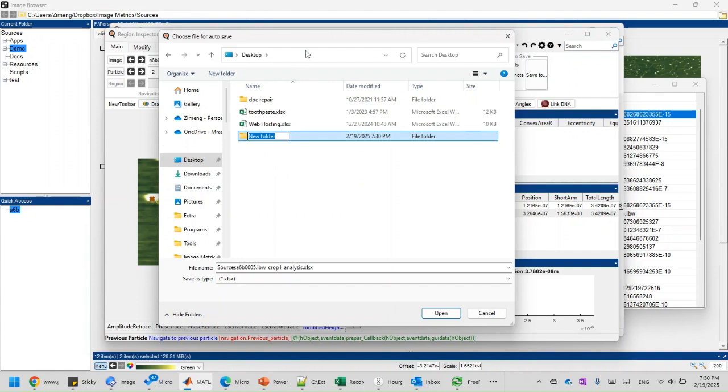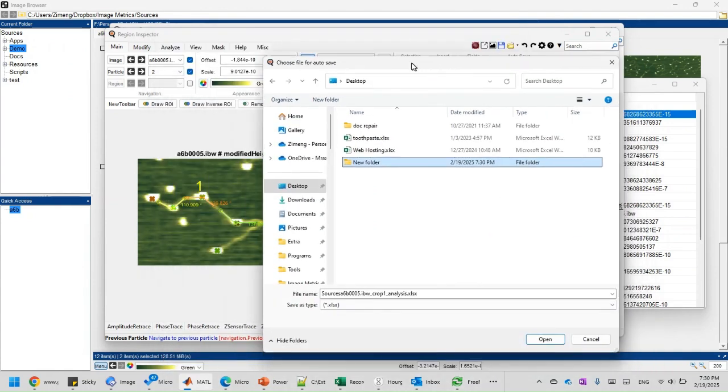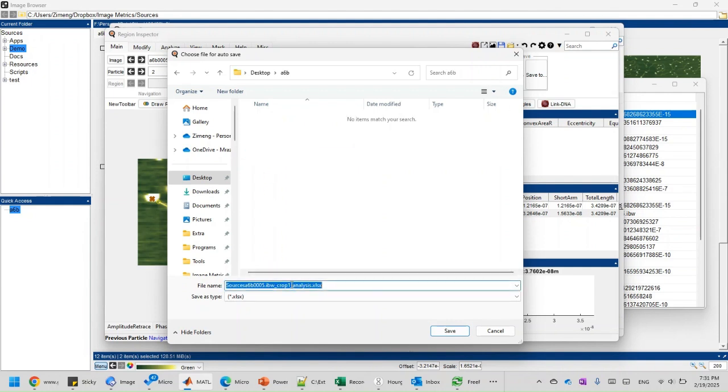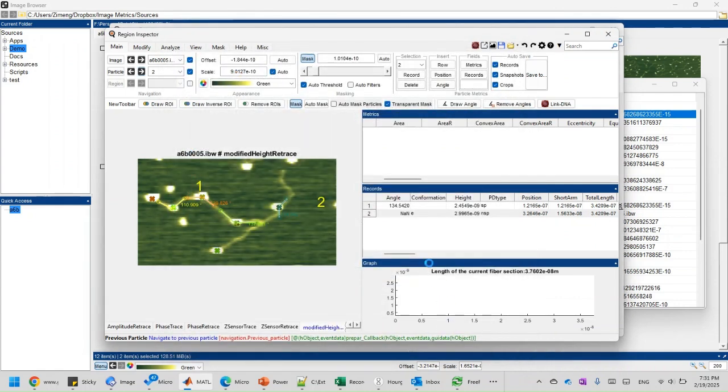I think it's A6B. Let's call that. And we have the name here. Let's name it analysis. Okay, click save.